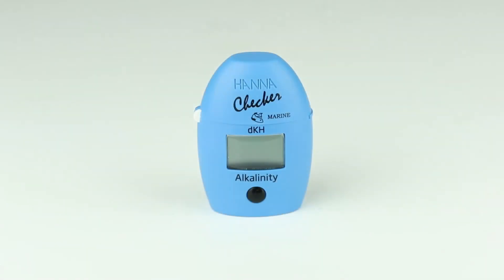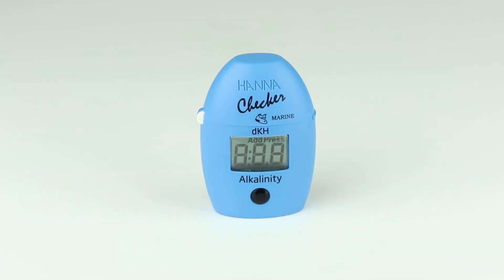The HI-772 is designed to make testing quick and easy. Press the button to power the meter on. Notice ADD-C1 appears on the screen. You are now ready to begin testing.